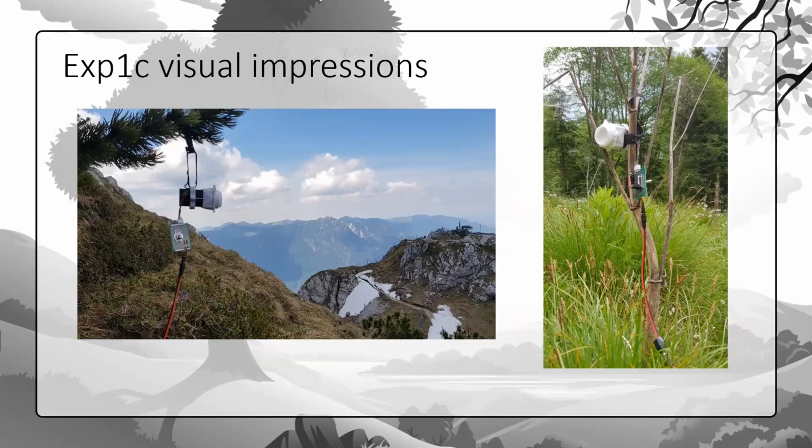So now it explains why it has this funny little middle ring stuff. So you can attach it on twigs. Of course, you can just take a stick with you, push it into the ground, and then attach the device. Right now, as a prototype, it has a super nice switch. It doesn't have the risk of cutting yourself right now. And the battery is not visible. It's actually oversized. The battery is still working over like 20 hours of collecting time. So far, so good.